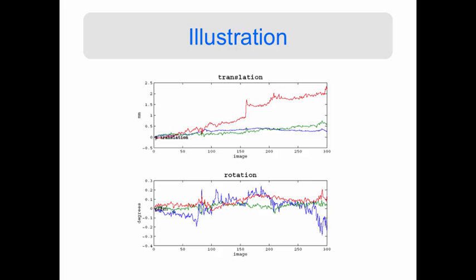Okay, let's assume that this green oval is the target image. And let's suppose that we have another image, which is this purple oval. The goal here of motion correction is now to align them with one another. So basically we want to translate and rotate this purple image until it aligns perfectly onto the green image as follows. Once we do that, we can look at the translations and rotations that we needed to make at each time point and study that over time.